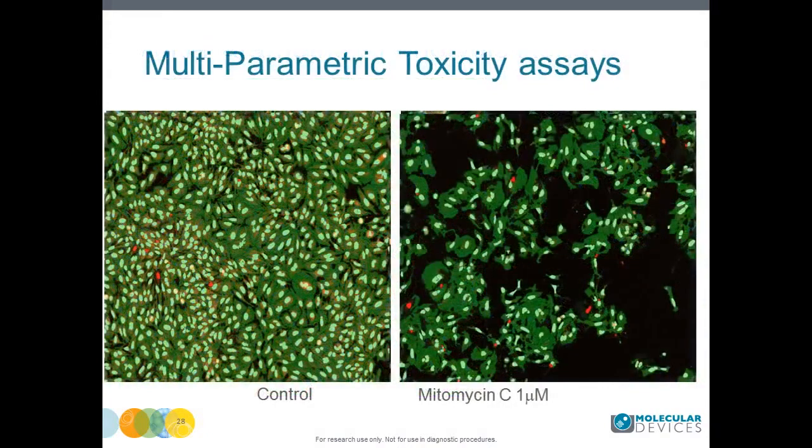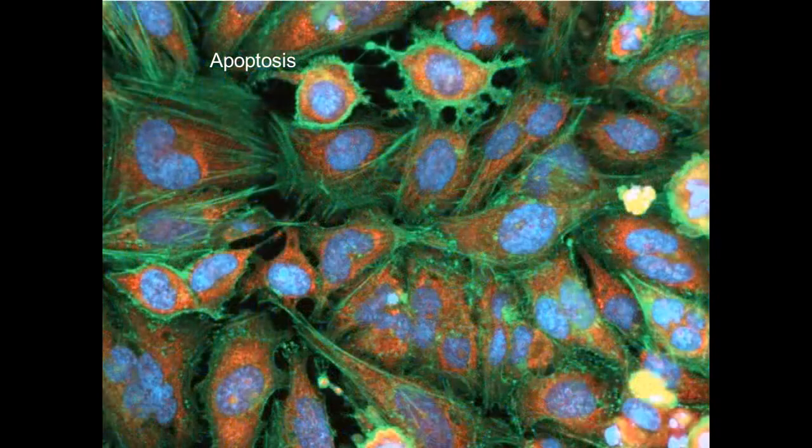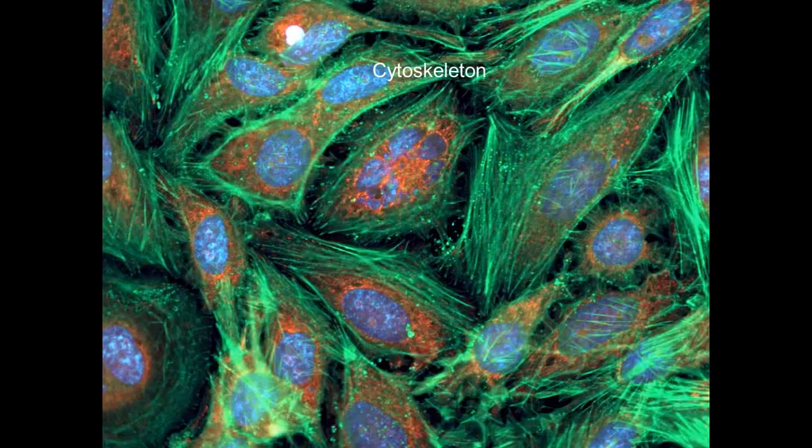Multiparametric assays are especially useful for description of complex effects, subtle changes, and allow to describe various phenotypic effects. For example, you can observe very subtle effects of compounds, in this case, to spot apoptotic cell. By measuring cell area or signal intensity, you can describe changes in cell spreading and also changes in cytoskeleton, in this case with paclitaxel.